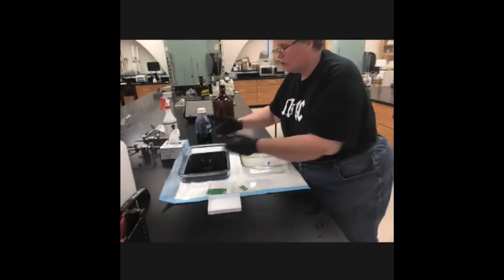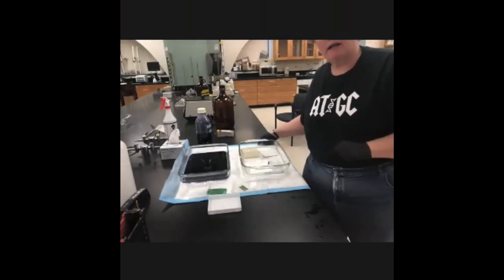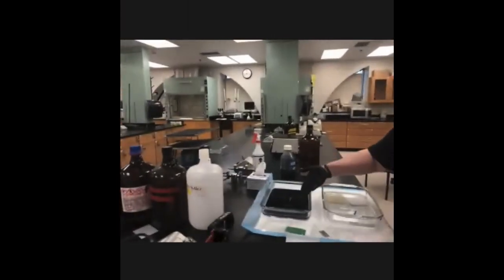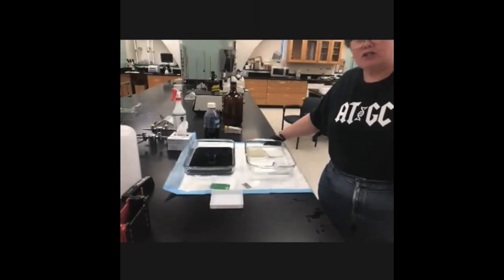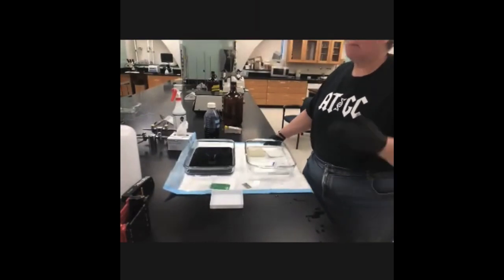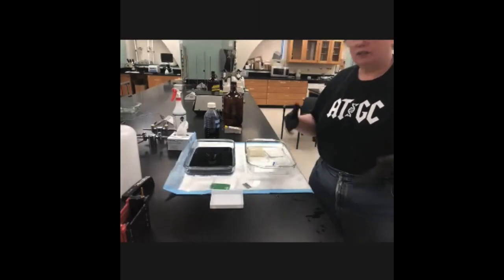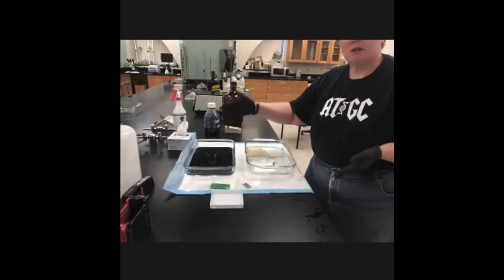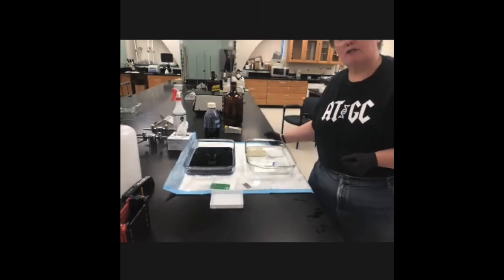Meanwhile, we're just going to put the Coomassie Blue on the rocker. We're going to rock it for approximately an hour to stain all the proteins in here. And after that, we're going to put it in a de-stain solution. The de-stain solution is 40% methanol, 10% acetic acid, the same thing as this is, except without the Coomassie Blue. The only difference is this is 40% methanol, 10% acetic acid with Coomassie Blue. Our de-stain has no Coomassie Blue in it.